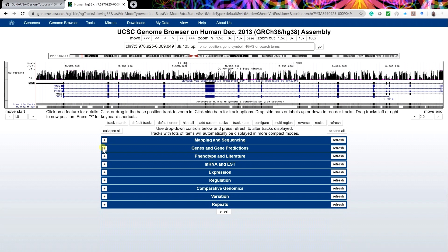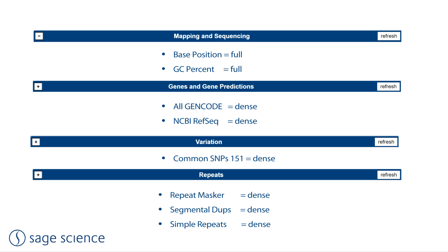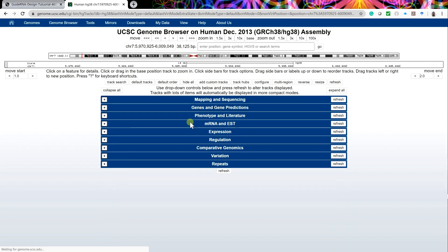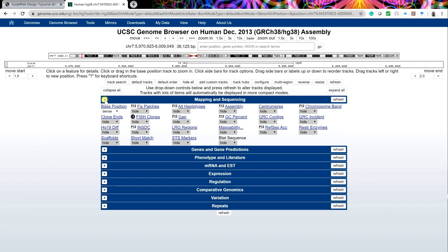The genome browser has many display options. For our purposes, we recommend the following settings be displayed. All current displays can be set to hide by pressing the hide all button. Starting with all displays hidden, enter these settings and make sure to press the refresh button when changes are made.